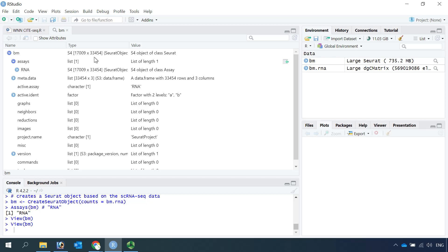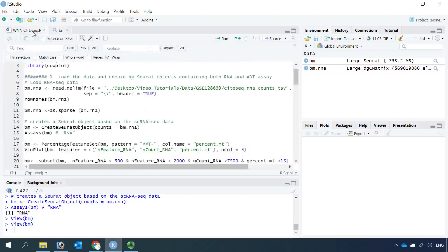For the online tutorial they only have around 30,000 cells, because they performed quality control. So we can perform quality control first.